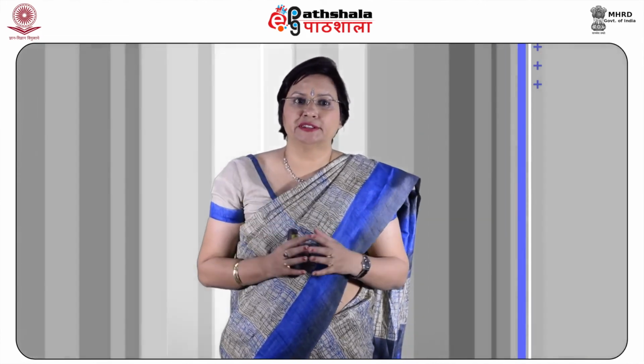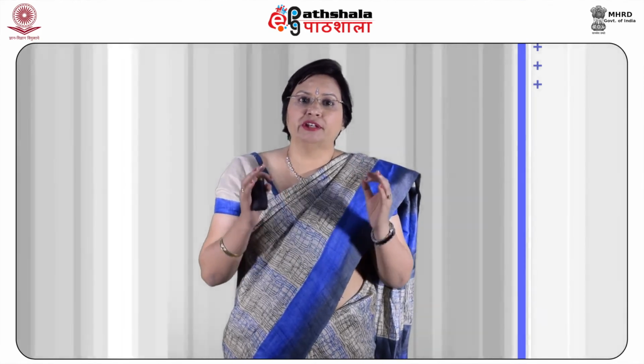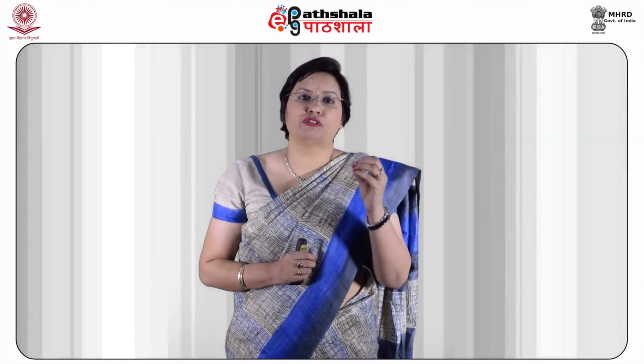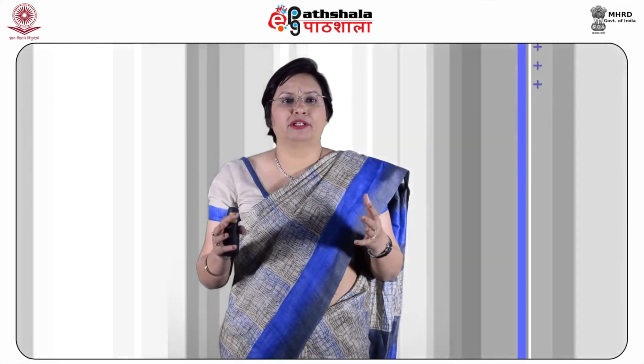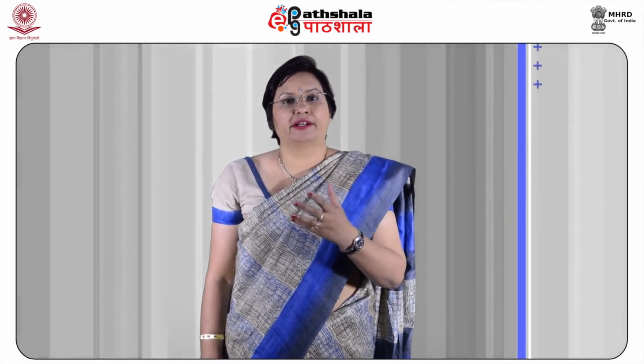We also studied the presence of metals and metalloids in water bodies. They are subject to serious concern because they are very toxic even at very low concentration. And we studied how atomic absorption spectroscopy is the most commonly used technique for estimation of metals in water samples, and it consists of a light source which emits light of a particular wavelength, an atomizer burner unit for introduction of a sample into the flame, a monochromator or a filter to isolate the characteristic wavelength, and finally a detector and a recorder.